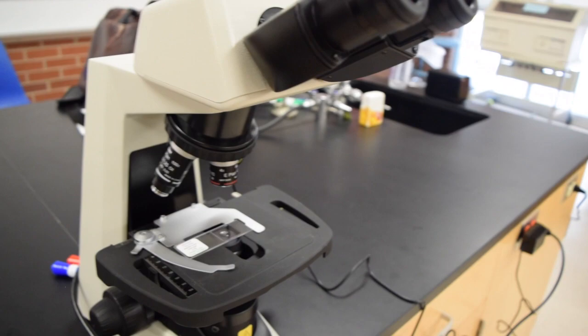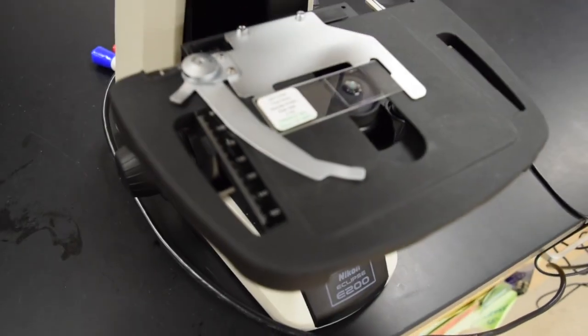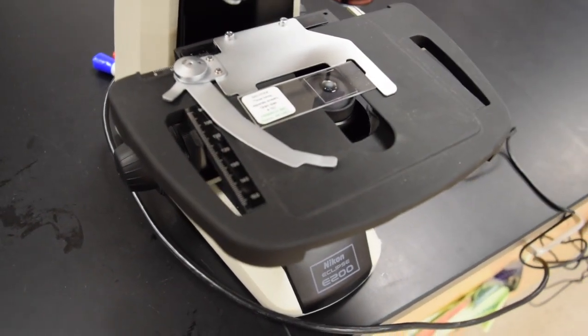We have the stage here with a stage clip that moves off to the side to hold the slide in place.